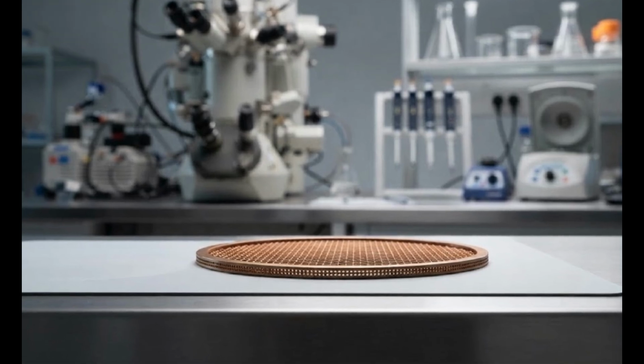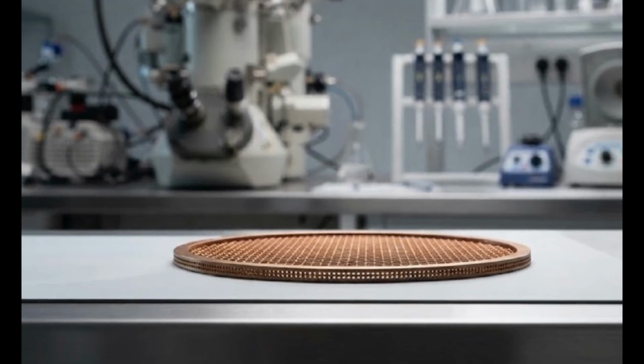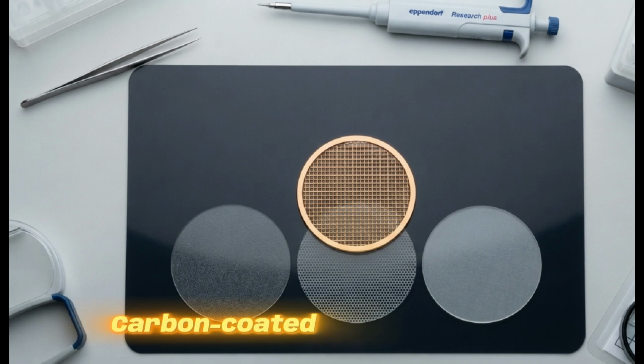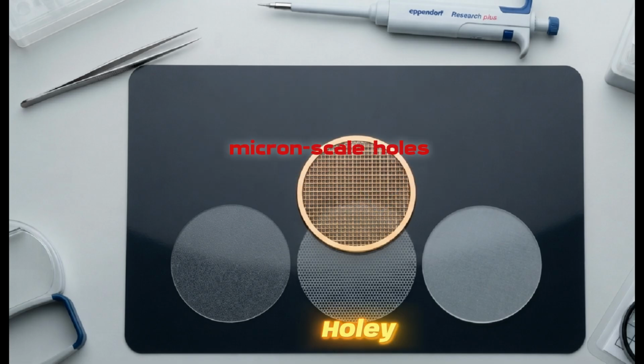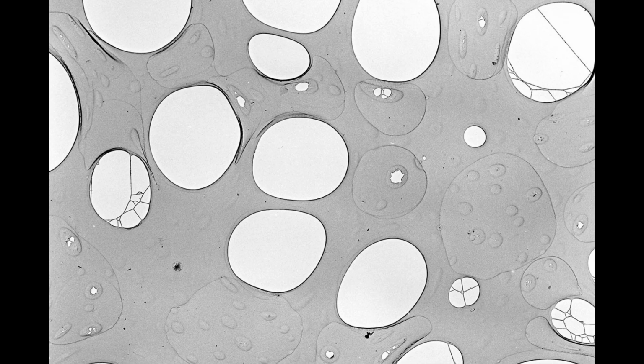While copper is the standard for most routine applications, the choice of the support film, the layer deposited onto the mesh, is equally critical. Support film types. 1. Carbon-coated grids. Feature a thin layer of carbon to provide support for nanoparticles and delicate samples. 2. Holey carbon grids. Feature micron-scale holes. These are the gold standard for high-resolution imaging and Cryo-TEM. The uniform holes allow for imaging suspended areas without carbon interference, minimizing background noise.